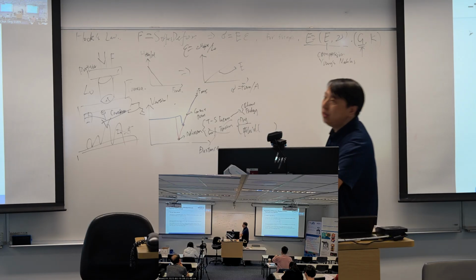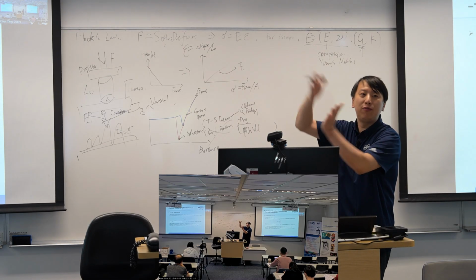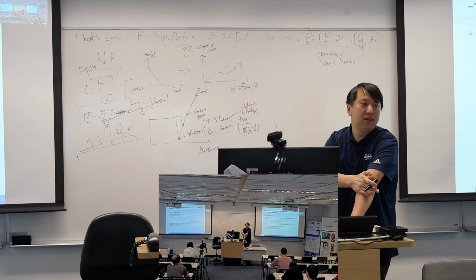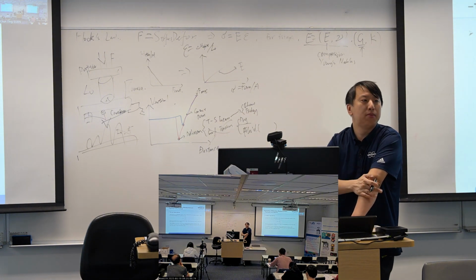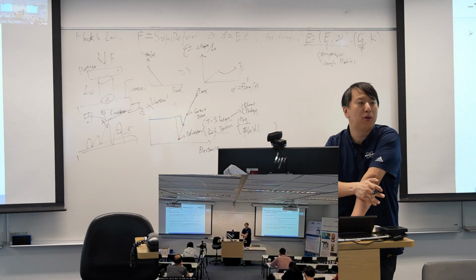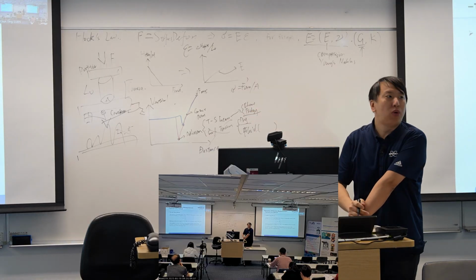For chemistry, usually people use it to measure the interaction between different chemical bonds. For example, gold and thiol, and we have some hydrogen bonds, for example, amine and carboxylic acid. And for biology, it has wide application.